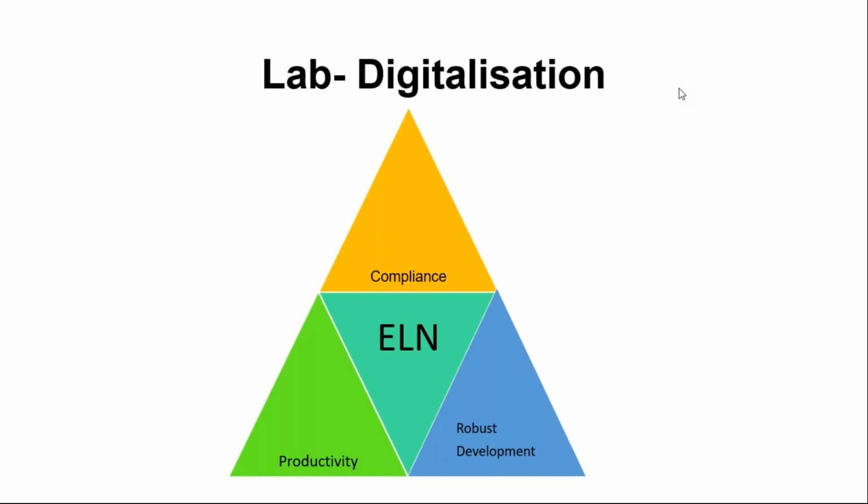Also, a lot of processes and workflows can be designed within the ELN, and that is how it can bring very real-time visibility to the processes, which helps in improving the productivity as well. And also, as Pierre has mentioned, the data which is generated through ELN can be used for analytics, which can create robust product development.